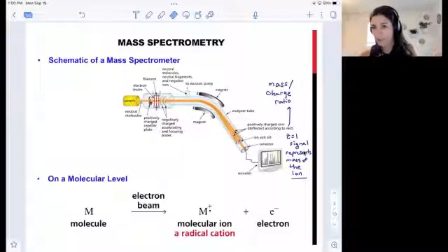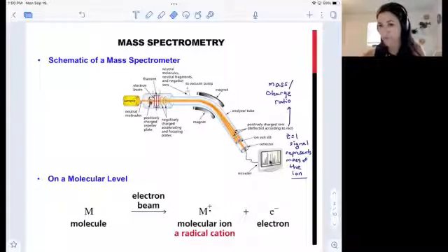And the data that we observe shows a unique signal for each unique ion. For us, the small molecules we work with tend to have a charge of 1. So mass to charge is represented as m over z. When z is 1, the value of the signal observed in our mass spectrometry data represents the mass of the ion that produced that signal.